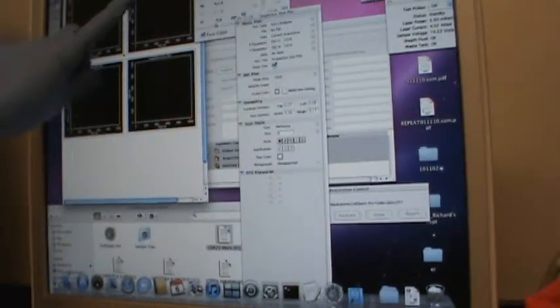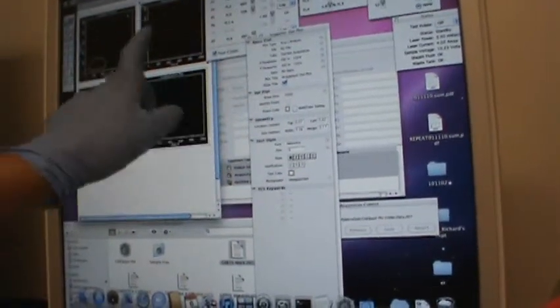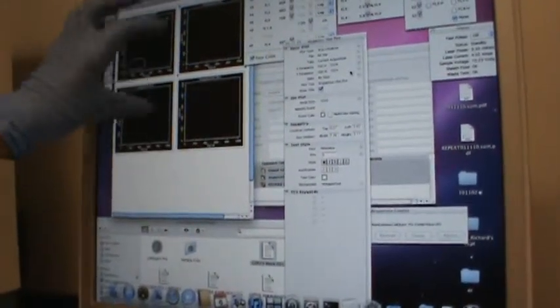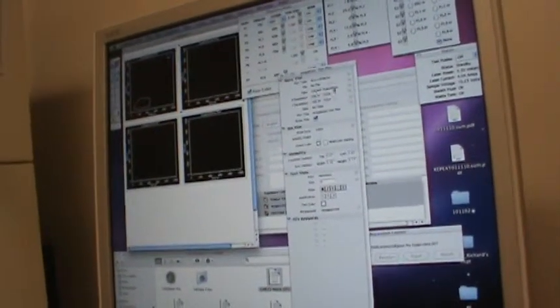Now I look back here, and in plot number 1, I know I'm reading plot number 1 because this is highlighted. If I'm reading this, this is for this plot. In plot number 2, I just want to see populations coming only from P1, because there might be junk which I'm not interested in. R1 is the region of interest, or the gate, the cells you're interested in. You don't want to see everything. So I would say here gate G1, that R1 is the region of interest.